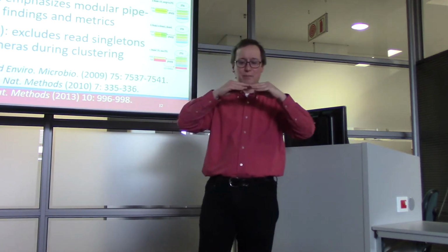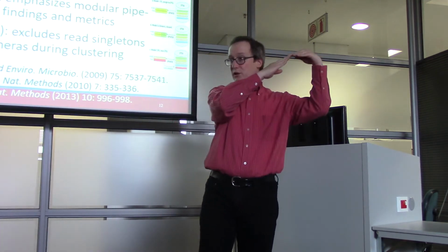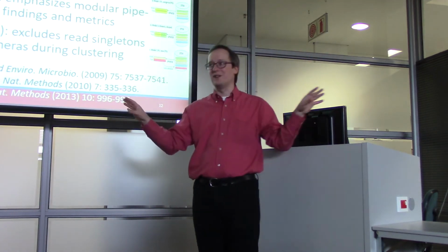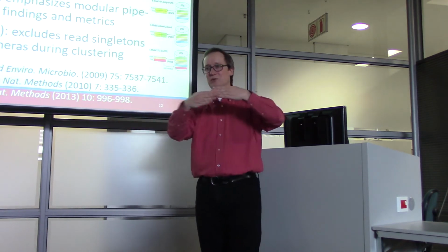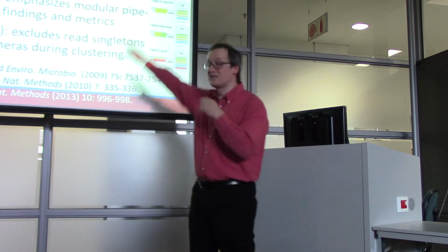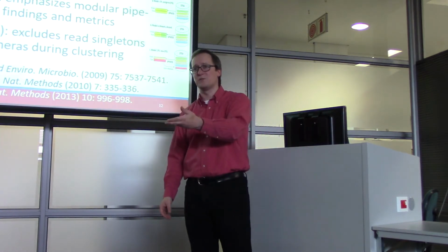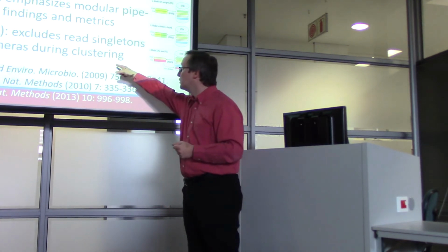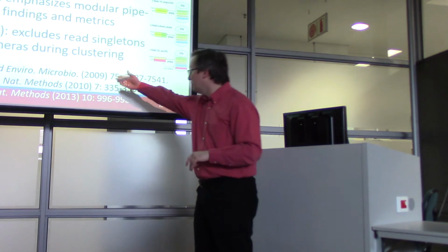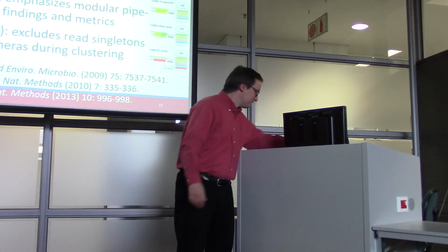A chimera that combines a segment from A and a segment from B is likely to look similar to the A and to look similar to the B. And suddenly your clustering goes haywire because these chimeras are dragging together different bunches of sequence. Now these other toolkits also deal with chimeras, but they tend to do it after clustering to look for these mistakes after the fact. But UPARSE is designed to do that in the course of clustering. So all three of these tools are out there. Some of them are free, some of them are not.